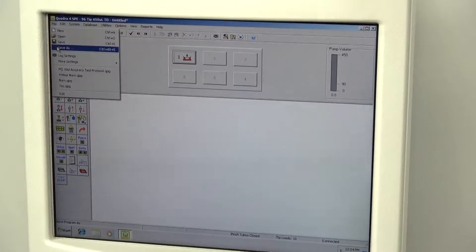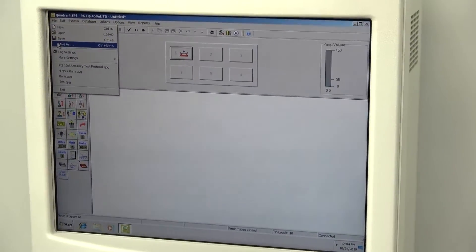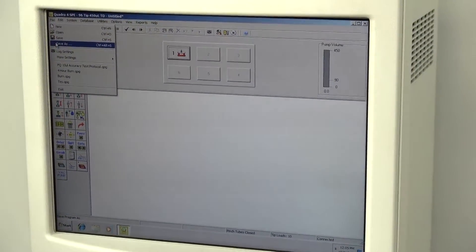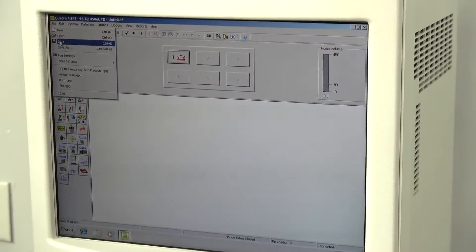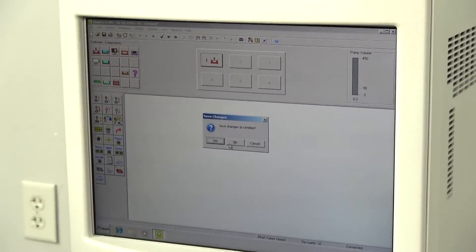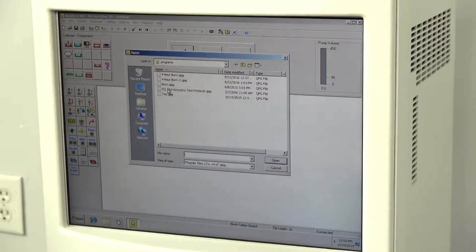Of course you can save, being this Windows 7 class operating system, you can open and save to the network, and of course it has a typical interface that you're familiar with.